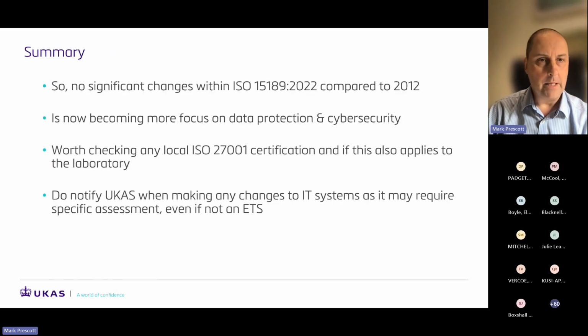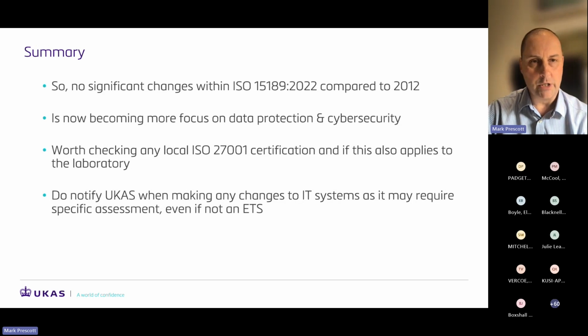So just as a summary, there's been no significant changes within 2022 as regards IT systems and data management. It's all very much the same. They're just minor changes, but we are seeing a larger focus now on data protection and cyber security. It is worth checking if you've got any local ISO 27001 certification, checking that it applies to the laboratory. If it doesn't, perhaps see whether it can be. It's certainly not mandatory. We're certainly not assessing against it, but it can go a long way to supporting the suitability of your own IT systems.